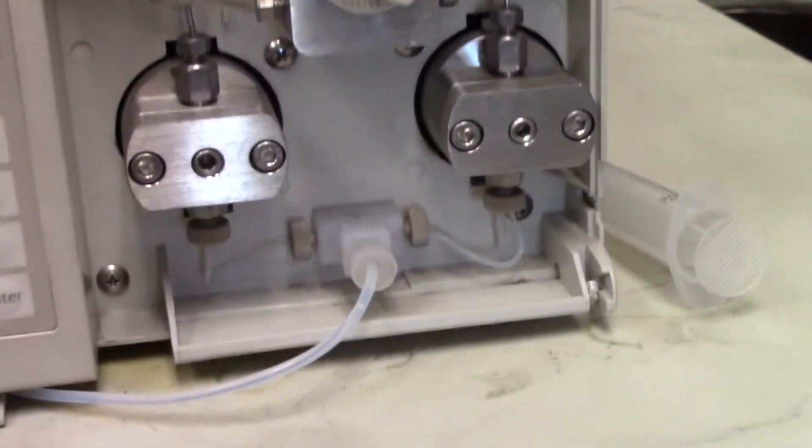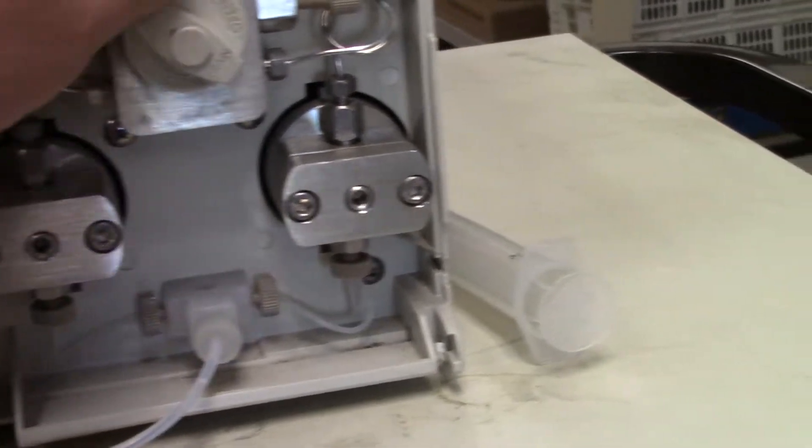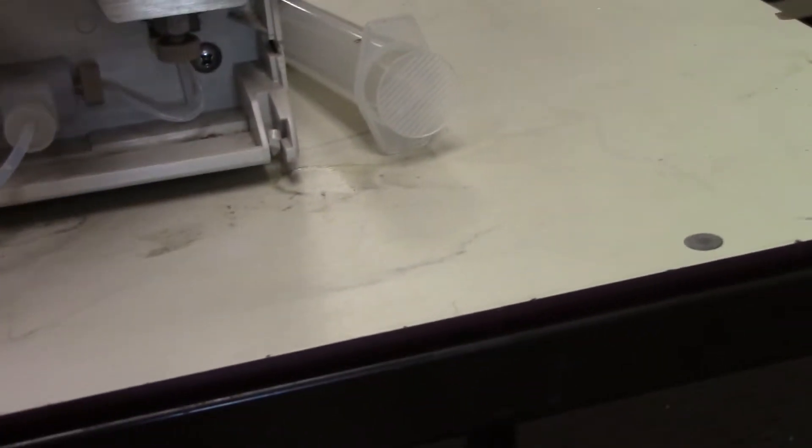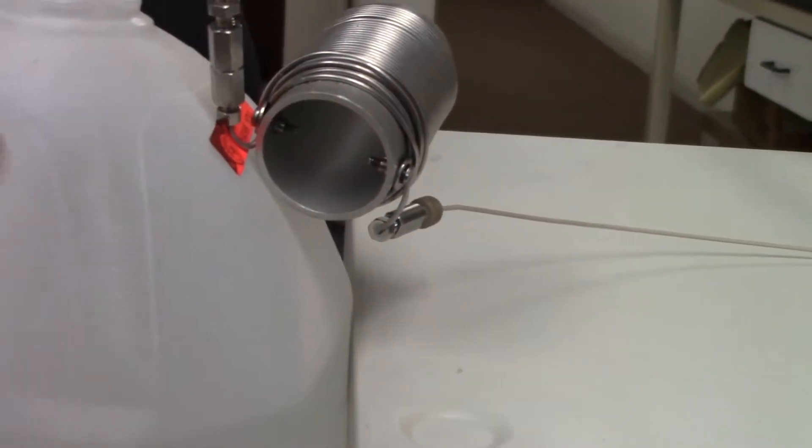Purge valve. Inlet. It's your purge line, over here. I just have it circling back up in and through. Circulation link and into.